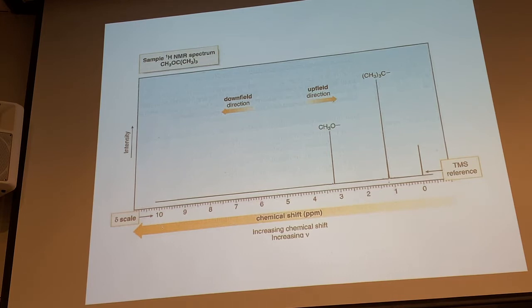Okay, because it's an alkyl thing, and it's 2 carbons away from the oxygen. We say it's shielded from that oxygen. The oxygen is, of course, electronegative, so it deshields the methyl group that's directly on that oxygen. So this methyl here is different than these 3 methyls, right? You see it down here at 3.2 or so ppm, and we could integrate this, and what would be the integral counting the area under this peak here? It would be 9 to 3 or 3 to 1, okay? So it gives us a lot of information about that.